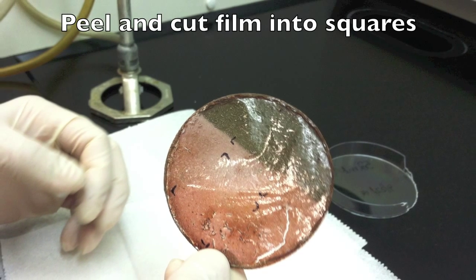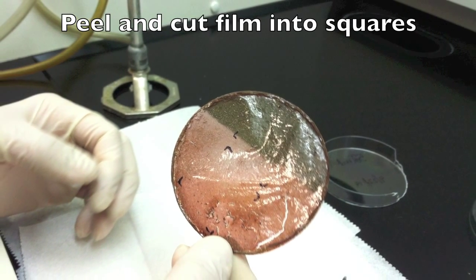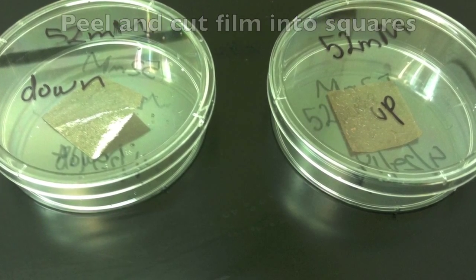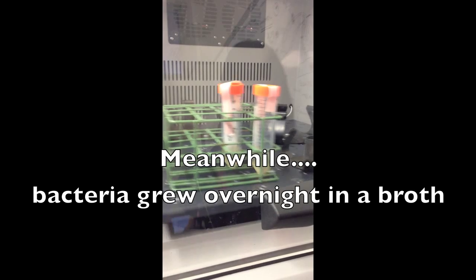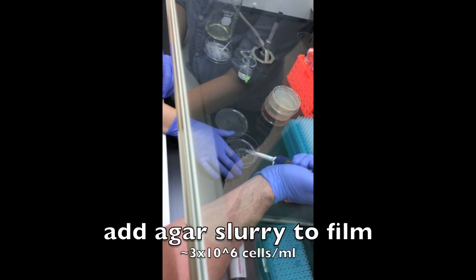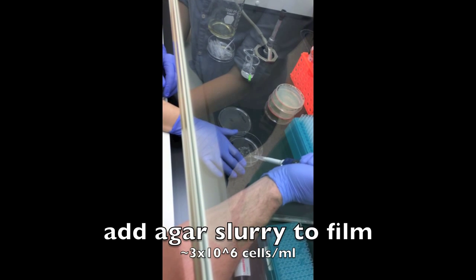The films were then peeled off from their petri dishes and cut into small squares in order to be analyzed antibacterially. We grew bacteria, E. coli, in a broth and then placed this in an agar solution, which allows bacteria to grow and is good for cultures. This agar was then placed onto the cut-up film squares.